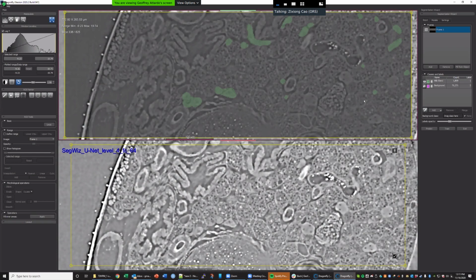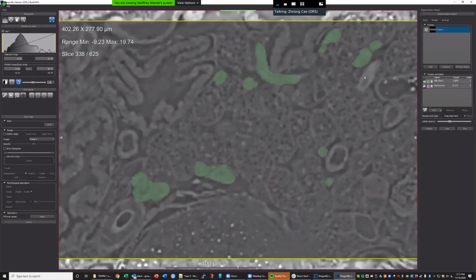Yes, I think that's a very good point for why we have multi-slice models. Currently we are training a single slice model because the multi-slice will take more time. I don't want to use it for the demo for now. So we need to take one of the other ROIs and make a multi-ROI out of it, I think.